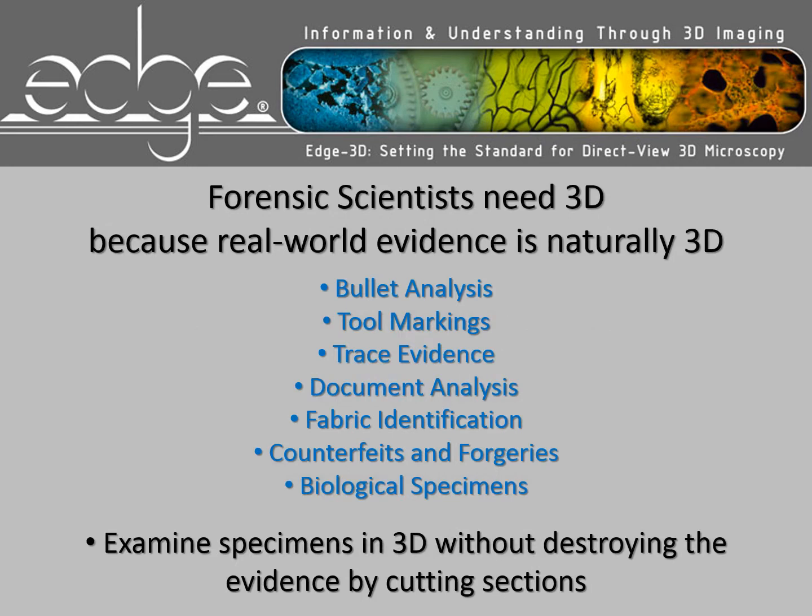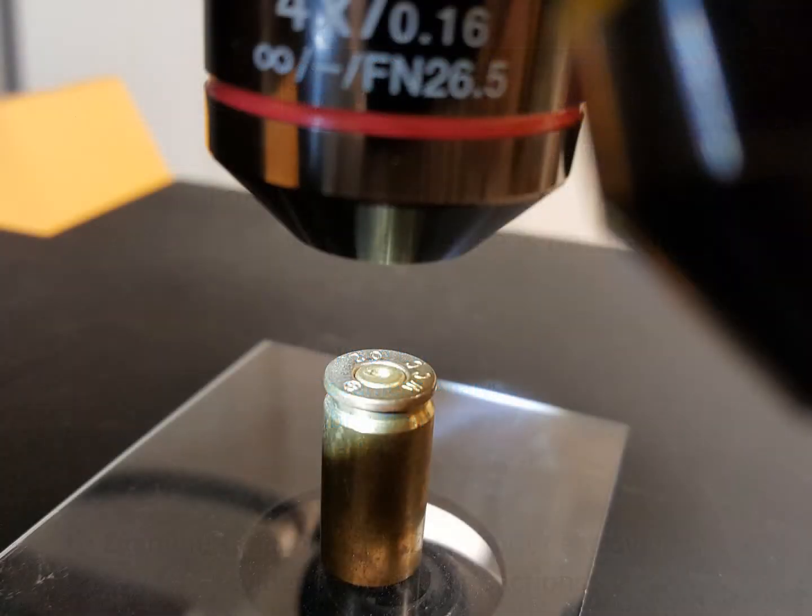The reason forensic scientists need 3D is because real-world evidence is naturally 3D. Things like bullet analysis, tool markings, trace evidence, document analysis, fabric identification, counterfeits and forgeries, biological specimens, these are all naturally three-dimensional objects. The advantage here is to be able to examine specimens in 3D without destroying the evidence by cutting sections. Let's start by looking at the shell casing of a bullet using the Edge 3D microscope.